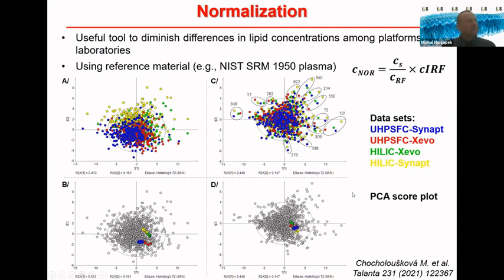Now, one slide with normalization. This is something I don't like too much, because various types of normalization may hide problems in your methodology. So if you use it, just do it with care and be sure that you don't introduce anything artificial.